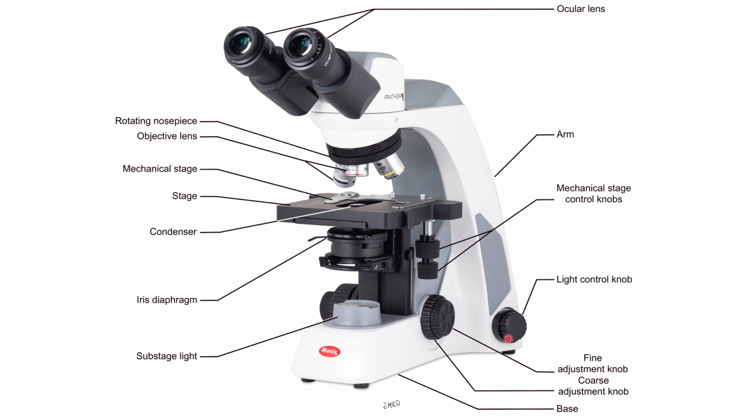The technical term and the term that I need you to know, which is listed in your lab manual, is the rheostat. The rheostat is basically your dial that turns the light up and down, the intensity of your light. This microscope has it on the side. Ours is going to be on the front right here. And you never want it above 5 if you can. Between 4 and 6 is fine, but don't crank it up to 10. We have other ways of adjusting the light.